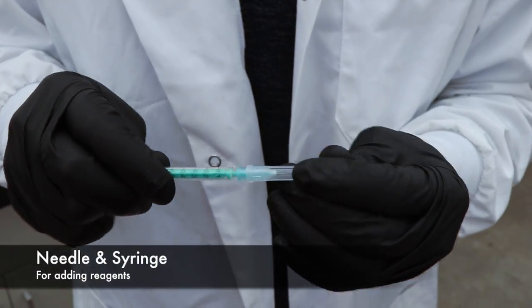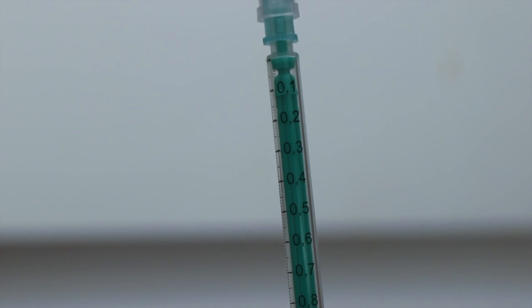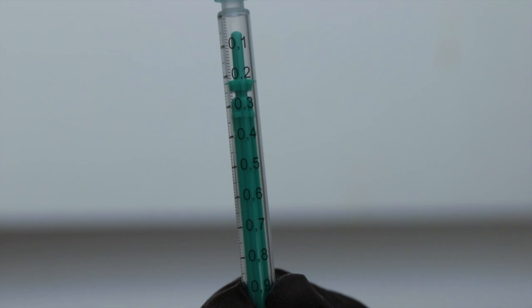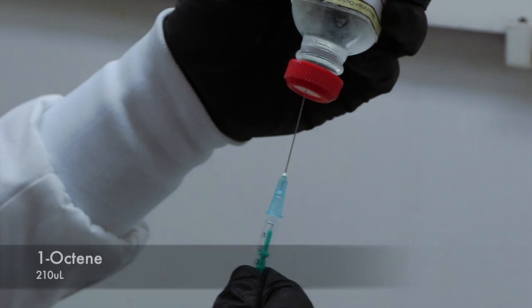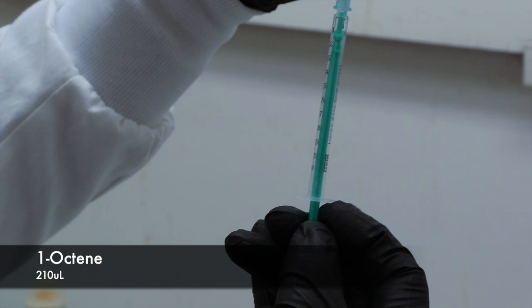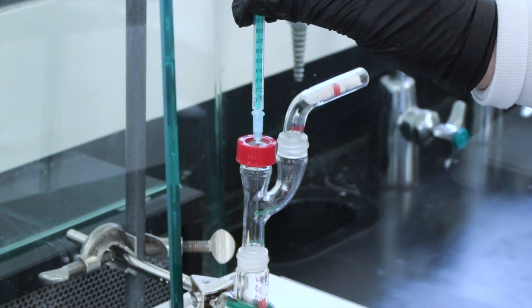I'll be using a needle and a syringe to get the reagents, and just to equalize the pressure within the reagent bottles, I'll be adding about the same amount of air as I will be removing reagent. Since the boron complex is violently reactive with water, both of the reagents for the hydroboration step will be in a ventilated hood, and each will have a cap and septum so that they can be removed with a needle, therefore minimizing exposure to the atmosphere.